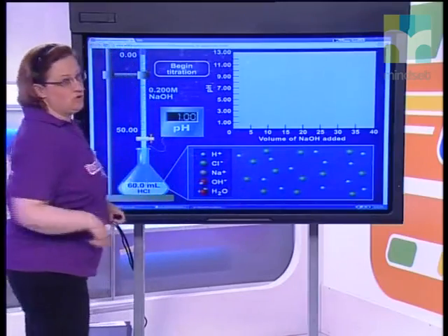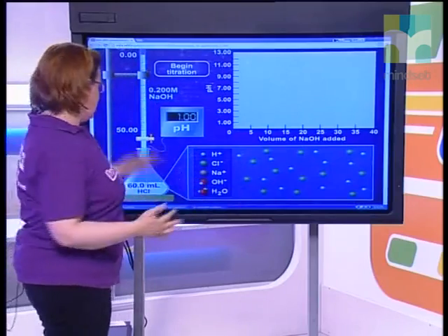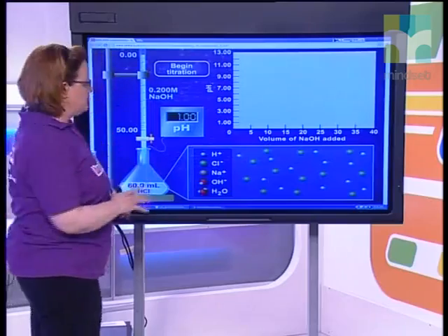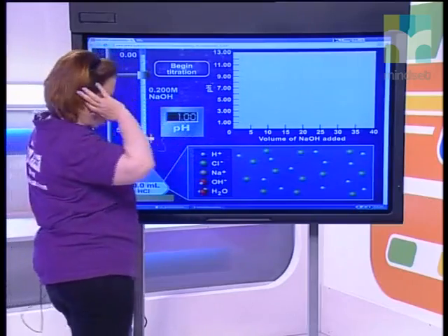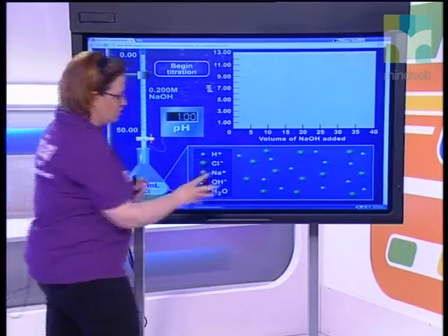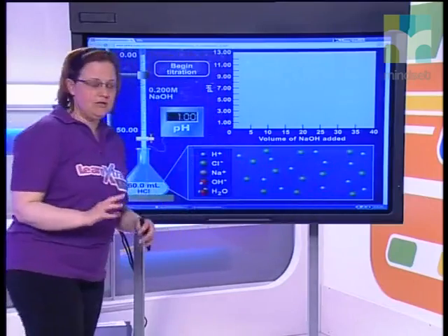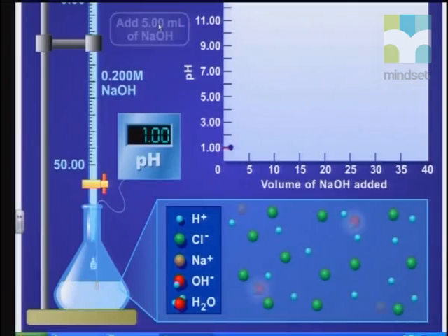The nice thing is that it uses a pH meter — a great way to do these. You would either do this with an indicator which changes color, or with a pH meter. Now, what we're going to do — and I specifically want you to look at the bottom right-hand side of the screen where it shows you how the molecules change — we're going to begin the titration, and I'm going to add five mils of sodium hydroxide.